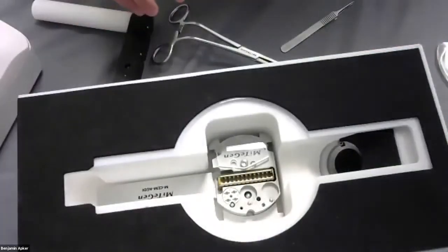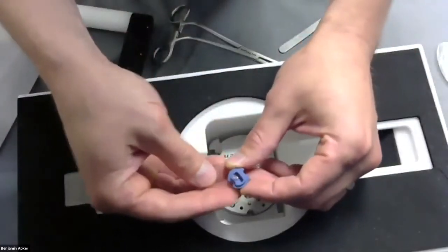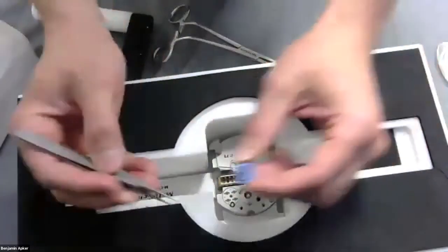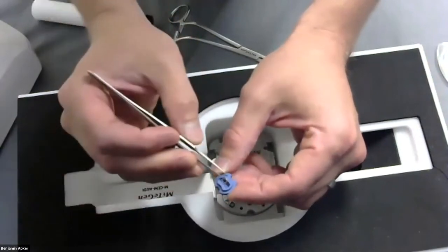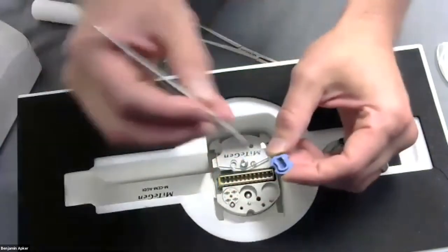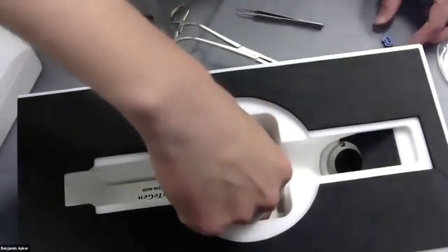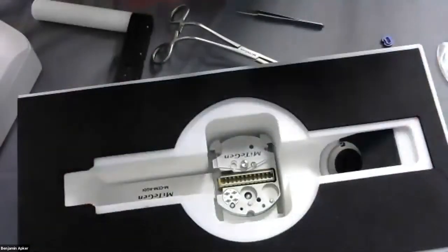The autogrid inspection station is designed to be inserted into any one of these wells and allows users to easily flip their grid back and forth, so you can inspect for clipping and make sure everything is good prior to transferring into the cassette. This would go in any location where you could place a standard cryo grid box, whether in this puck or in the standard loading station for the grid.